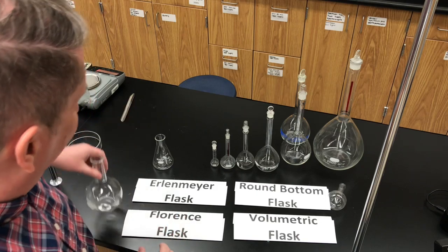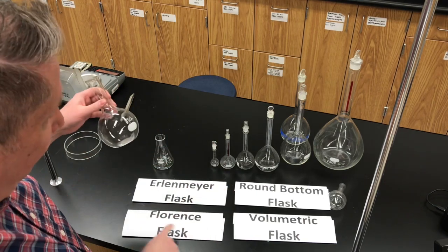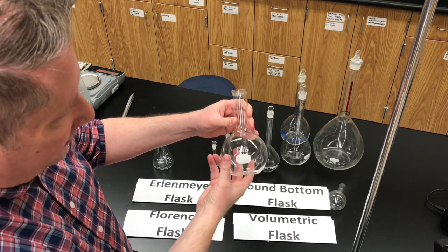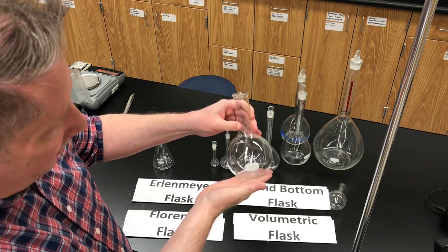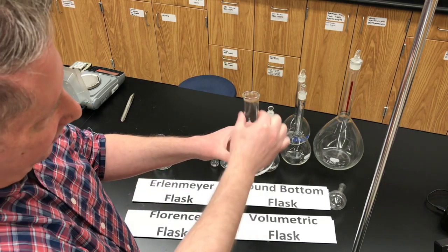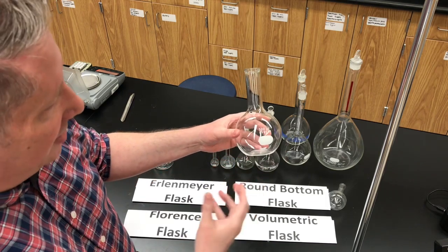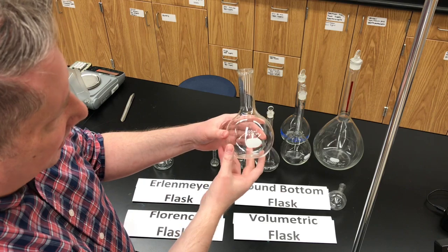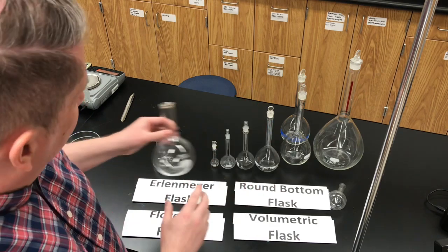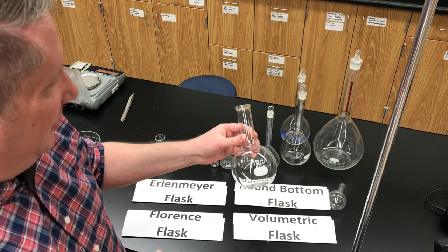A second type of flask that's less common, but you'll still see it once in a while, is called a Florence flask. This is a 500 ml Florence flask. It has a round base with a flat bottom, so it can sit on the benchtop. It has a tall neck, so it's sometimes used for boiling liquids — that's usually what it's used for — and it's sometimes also called a boiling flask. You can use both the Erlenmeyer flask and Florence flask to store liquids as well.